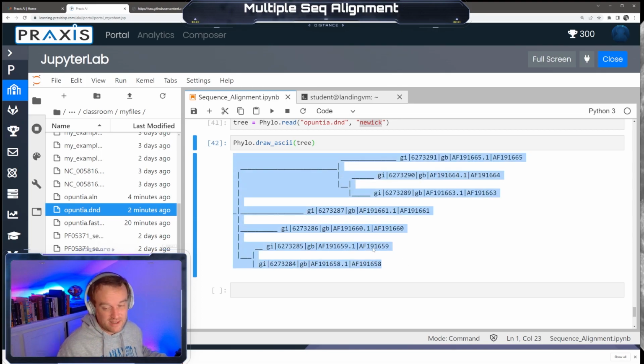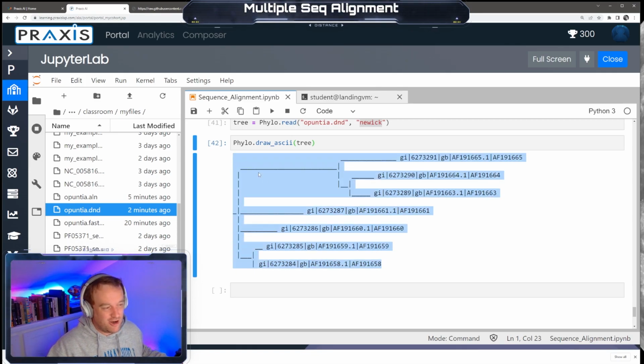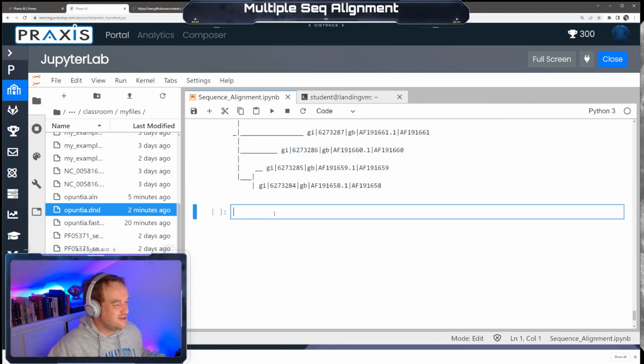You can do it in Python if you don't want to put the time in to learn R and Python. But R just makes prettier stuff. I know there's gonna be Python snobs out there like blah, blah, blah, but R makes prettier figures, and so this is really basic. Mid, is that what the kids say? This is very mid. Okay, so we'll stop here.